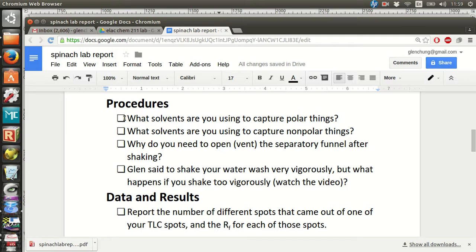Now, I think I mentioned in one of the videos that I've posted here that I made a mistake by asking you to shake your water washes very vigorously. Yeah, I'm sorry, that was due to my own ignorance. And I want you to say in your procedures what happens if you shake too vigorously. What happens? What do you form? And then why would that be undesirable? You're going to have to watch the extraction video, which I posted, and you're going to have to also think about that in order to know why that would be undesirable.